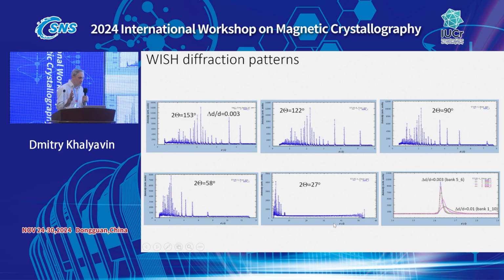So why it's like that, you can work out yourself. It all comes from the Bragg law. So we have a fixed lambda range which we cannot change. It's a characteristic of our beamline, and then based on the Bragg law, you can work out what will be the accessible d-spacing range.